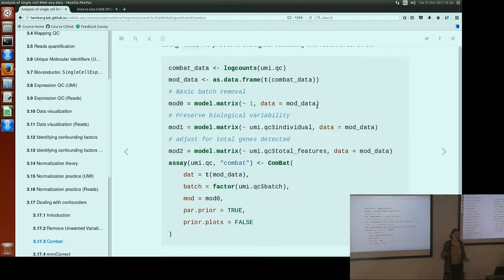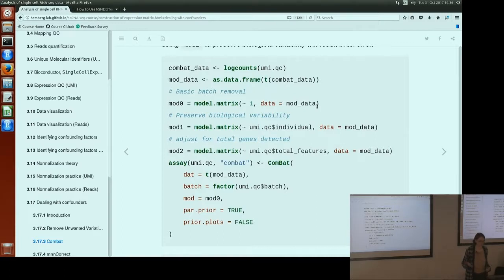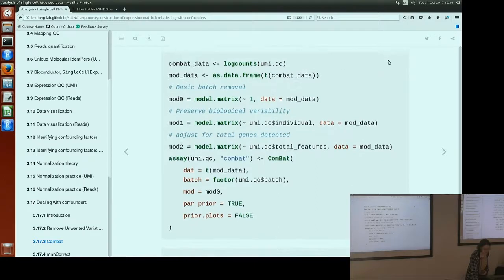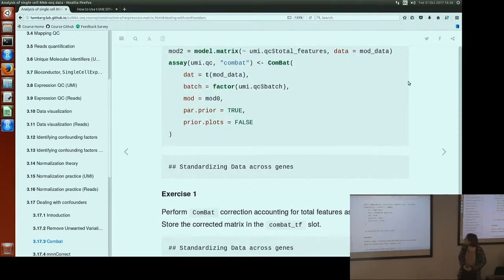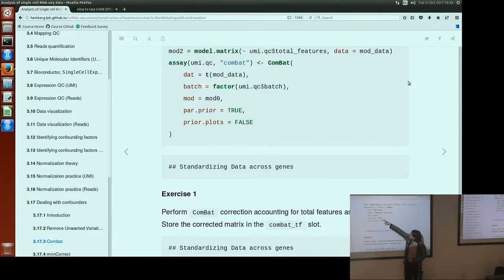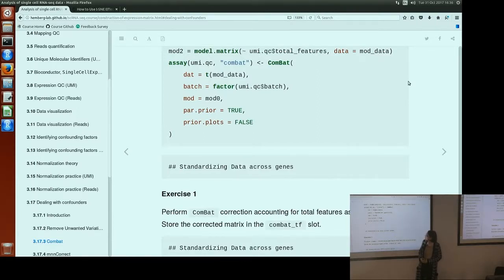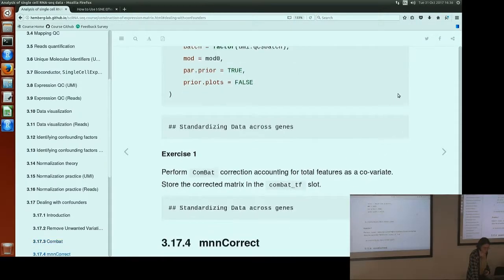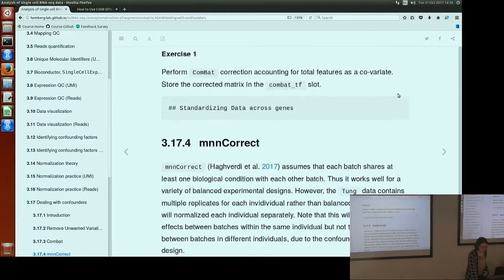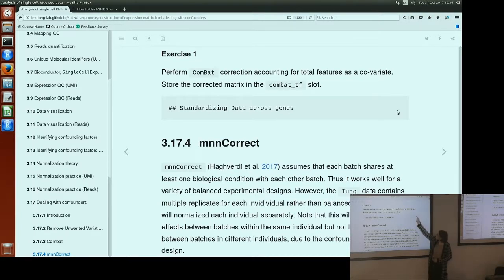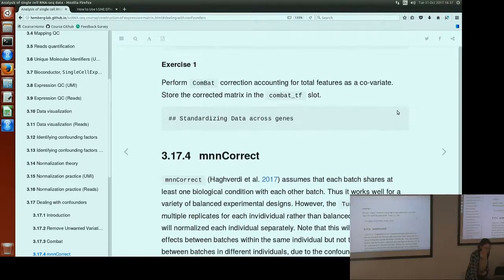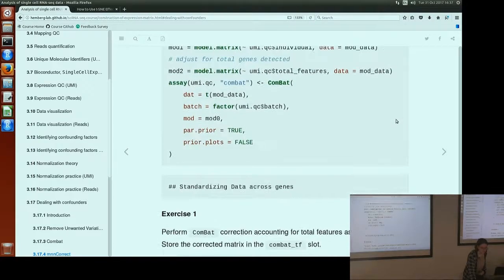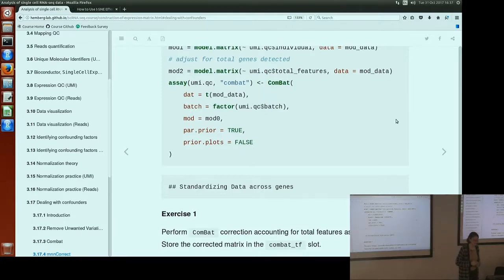And now it won't know about the biological variance that we care about, so it will remove all of it, all of the variance, both the batch and the individual, because we have a confounded experiment. That's how you run it. And then we have the data. We have our vector batches that we want it to remove, and then the model of what we want it to preserve, and some extra parameters that aren't important. So we have an exercise here to perform COMBET yourself, only now accounting for total features as a covariate in the model. So replace this model with a model that accounts for total features. So I'll give you five minutes to do that.